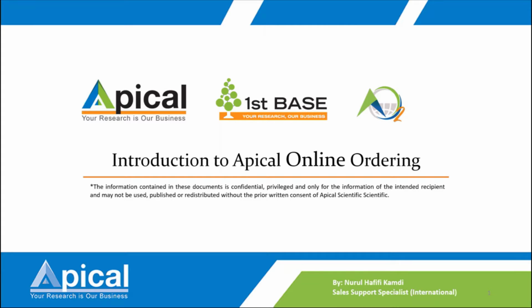Also, Sanger sequencing may take a longer time if you want to sequence a huge DNA. If you want to sequence the whole genome, it will take a very long period, so with next generation you can make it fast. But do you really need to go up to next generation sequencing?